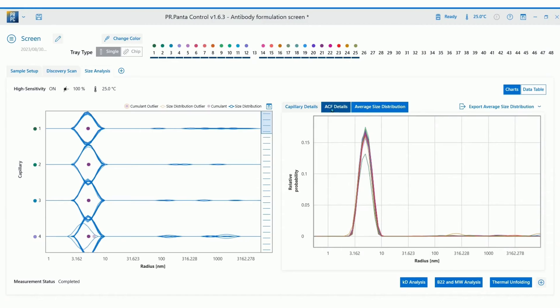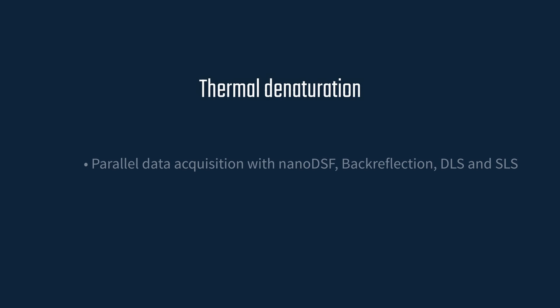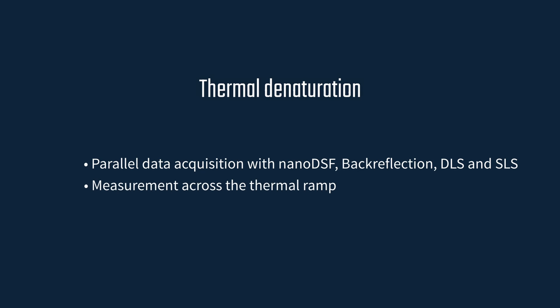Finally, you can also review the autocorrelation function to assess data quality. Next, I'd like to show you how to perform a thermal denaturation experiment. Thermal unfolding measurements collect data from nanoDSF, backreflection, DLS and SLS in parallel along the entire thermal denaturation gradient.